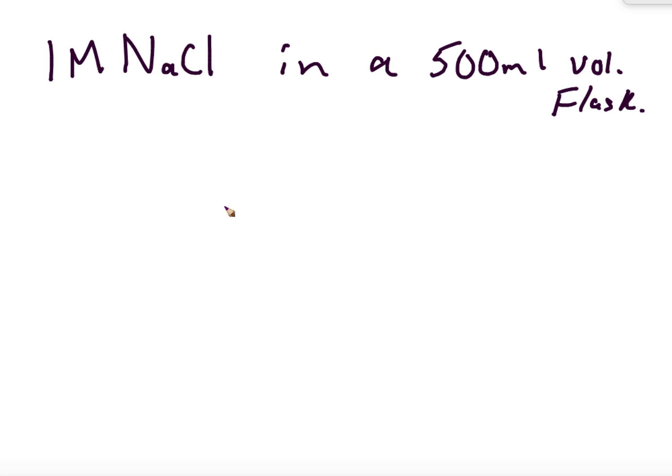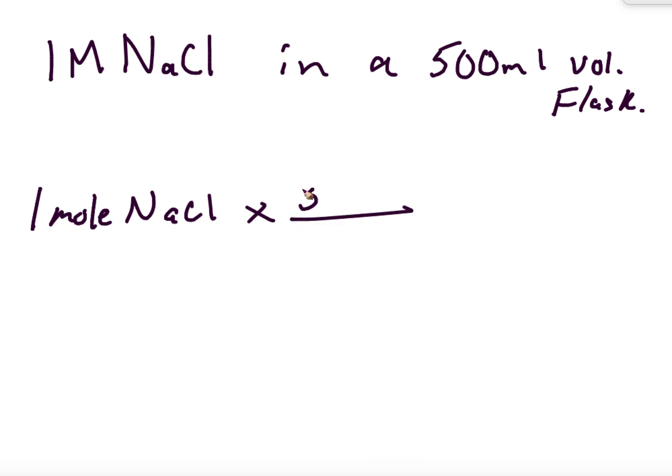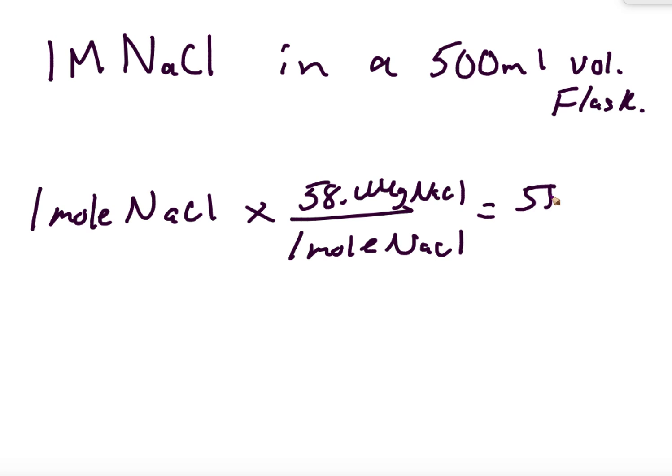From here, we already calculated 1 mole of NaCl times 58.44 grams of NaCl, just like before.